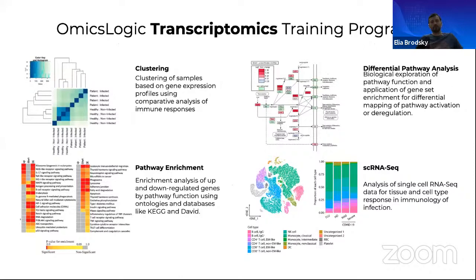And what's important is that we will touch on some aspects of RNA-seq data that turns this data into an excellent resource to understand the complexity of biological regulation, how it is affected by the immune response to pathogens, and to study these types of variations at both tissue and organ bulk RNA-seq to get a snapshot of what's going on, as well as a very detailed understanding of how differently this process can take place at the single cell RNA-seq level.